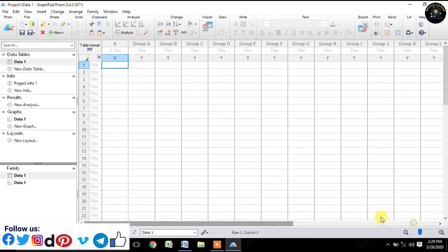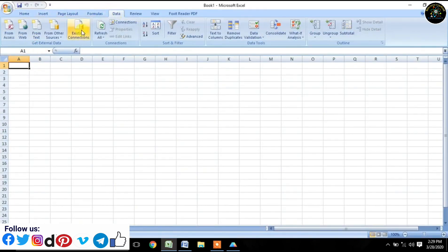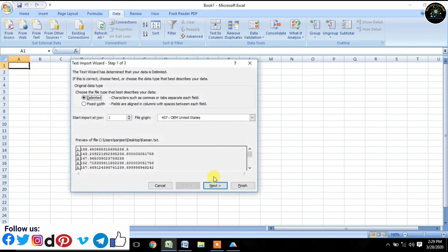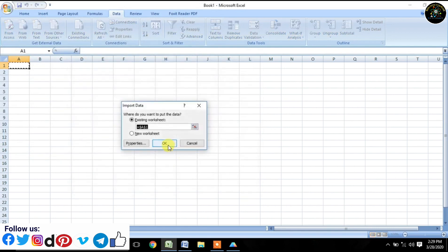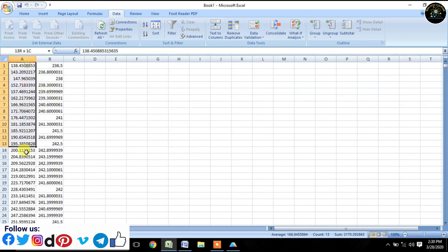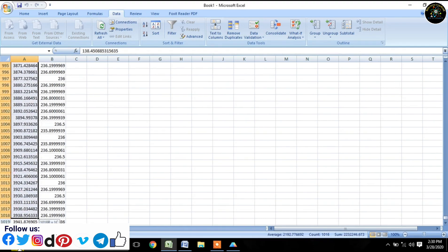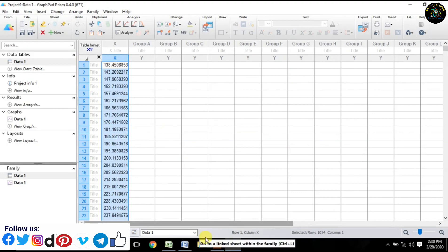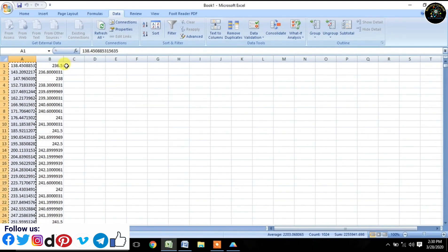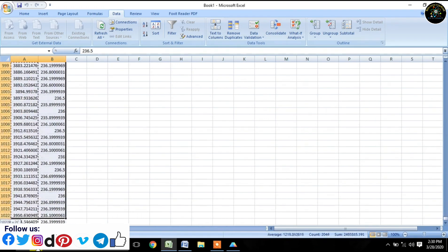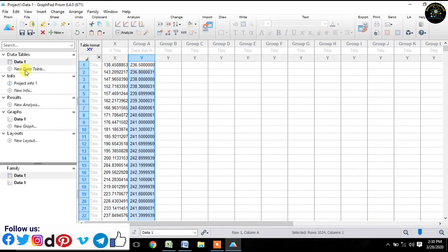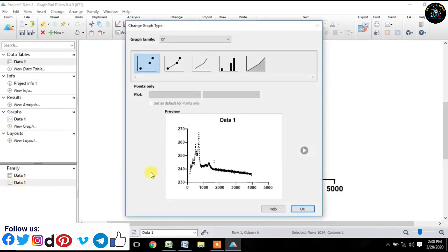Just follow every step precisely and carefully. I will show you how to do the work of Prism Software.